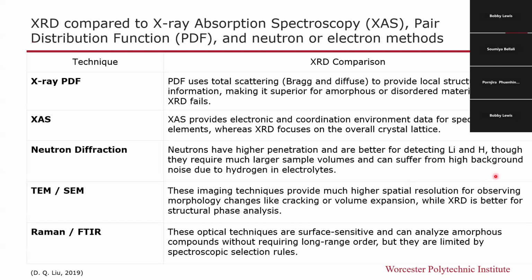On to the next slide, you will see that where X-ray diffraction falls short, there are other imaging techniques that will fill those gaps and correct those weaknesses.